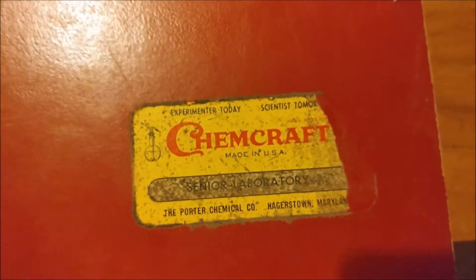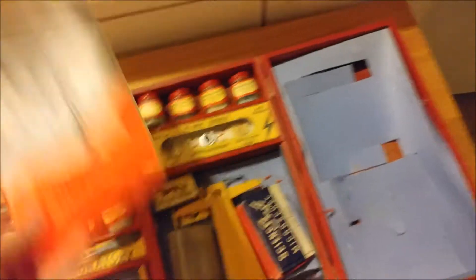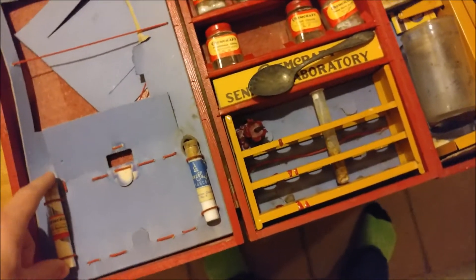This is an old ChemCraft set, made by The Porter Co. It doesn't have every chemical that came with it, and it also has some stuff that was not for the kit, like some microscopy stuff. But it has some of that, and there are also a few chemicals I'll go over.